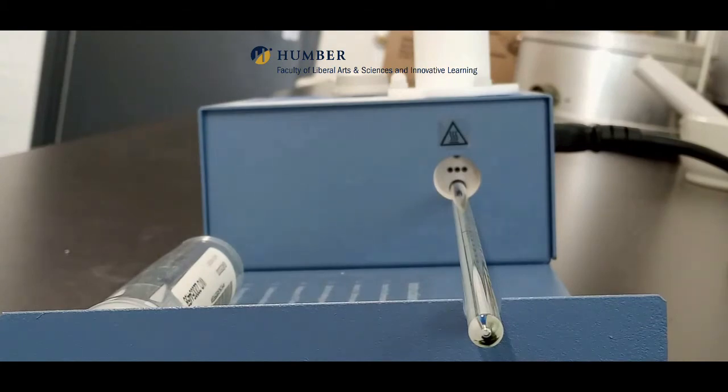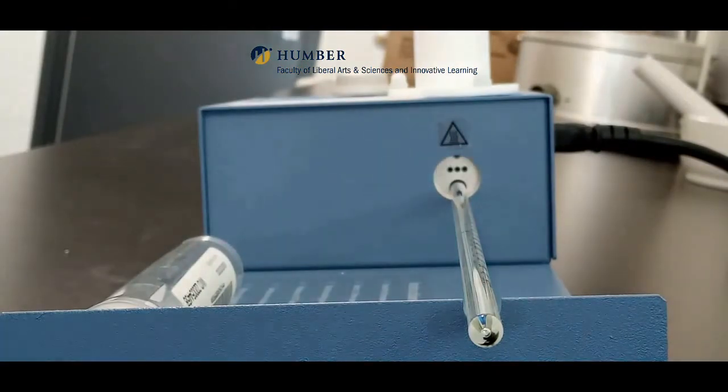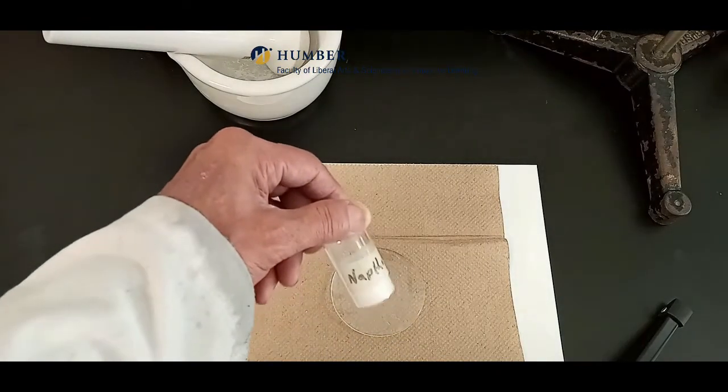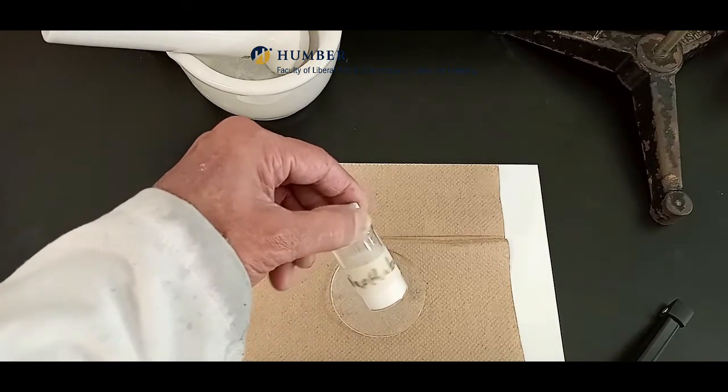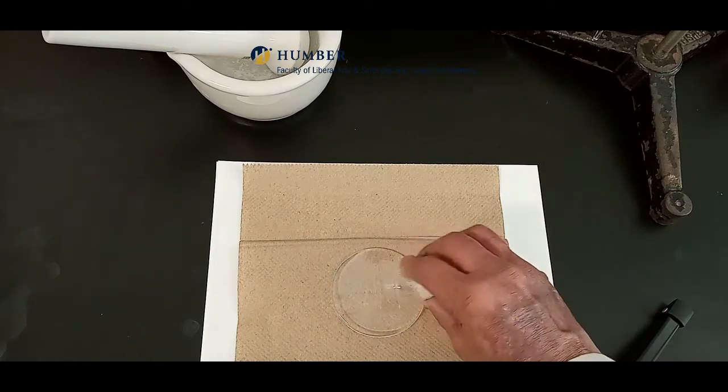This is the side view of the melting point apparatus. There are three slots for capillary tubes and a slot for the thermometer. The three samples are naphthalene, biphenyl, and a 50% mixture of naphthalene and biphenyl.